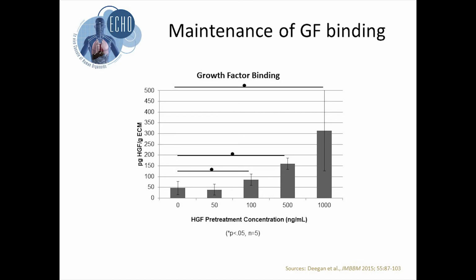let it go. We repeated this with EGF, which is more of an electrostatic interaction with the matrix and doesn't stick as well. And you get a similar curve, but then as you wash, it washes out at about the same rate. But this shows that the matrix does bind and hold growth factor.